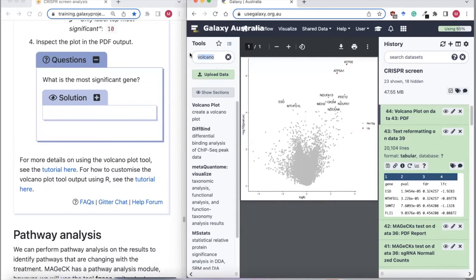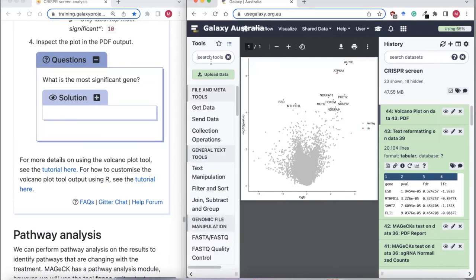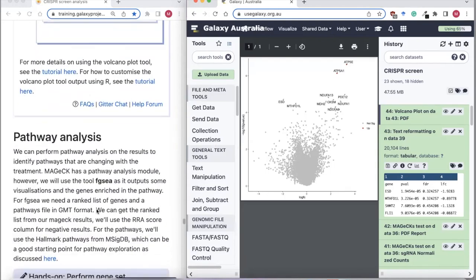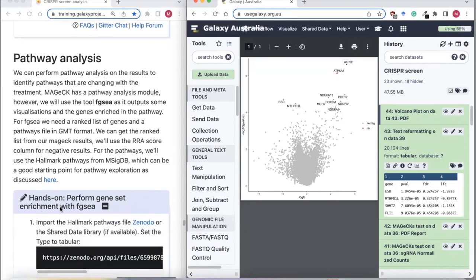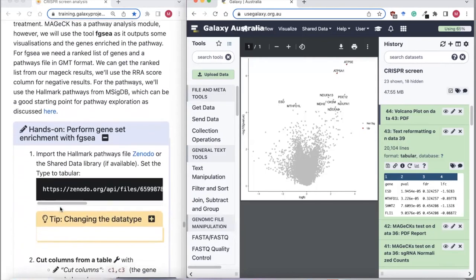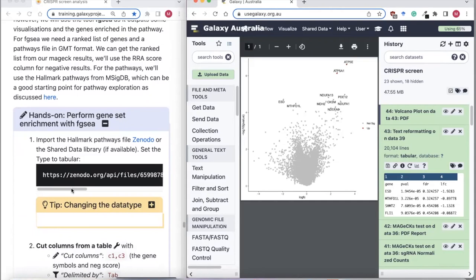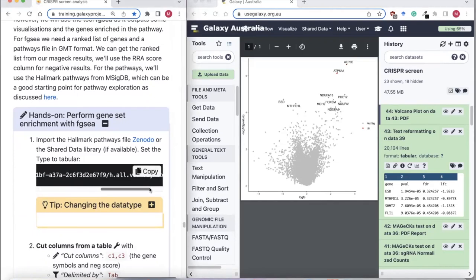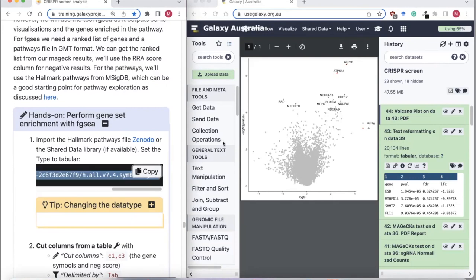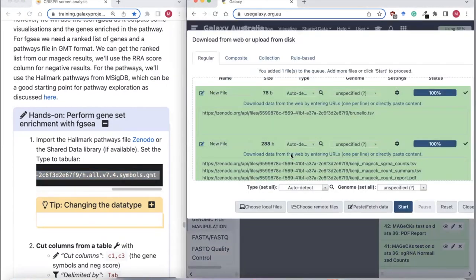If we want to identify central pathways between our drug treatment and vehicle control, there are many different tools we could use, but we'll use one called FGSEA — Fast Gene Set Enrichment Analysis. For that, we need a file of pathways. For human, there are hallmark pathways available from the Broad MSigDB website. We'll import that hallmark file using Paste/Fetch.